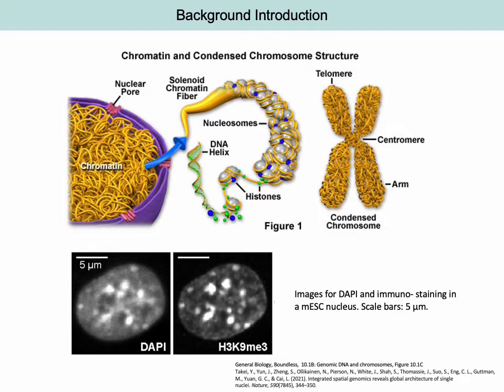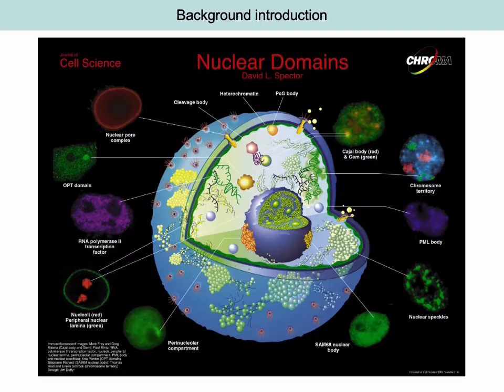Whenever you look into the microscope and you stain the cells with dye, which is used in visualizing nuclear DNA in both living and fixed cells, you see complex nuclear stains in the nucleus, and you can see DAPI stains. It's actually hard for us to wrap our heads around linking those two images together, and a very oddly structured nucleus with relative differences among different cells.